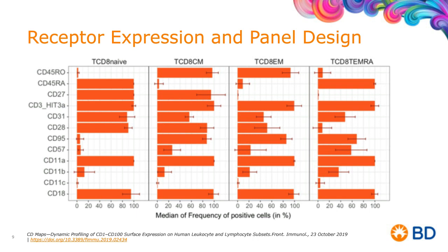What's on every cell. So we can see co-expression patterns for different subsets of cells. And it's our ability to place those colors then in the right places to be able to offset problems of spread.